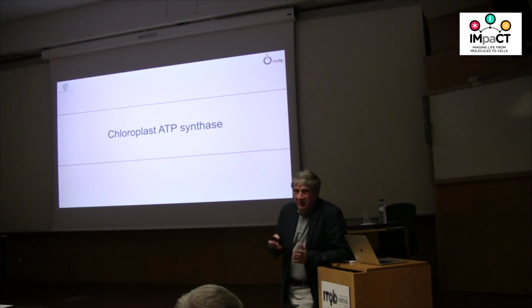Why don't you only use the first frame? Well, for the reason that I just showed you, it's the least good, because it moves most. If you could solve that problem, then you could collect lots of first frames and average them. That's what we're working on, but still the limiting factor is the movement.